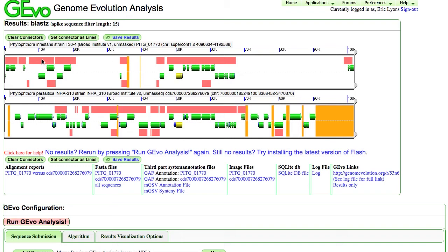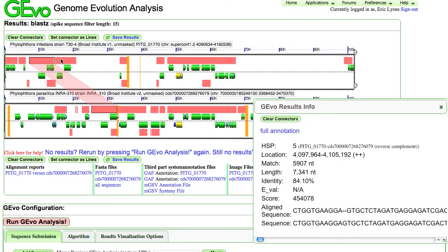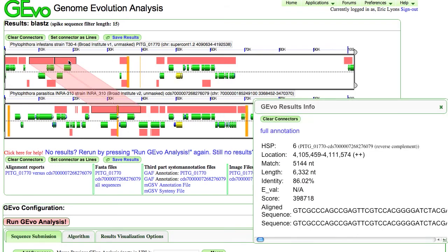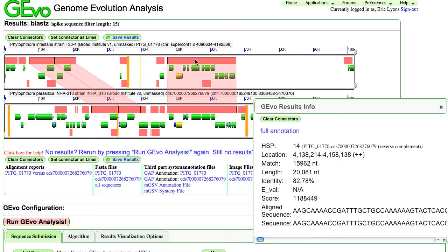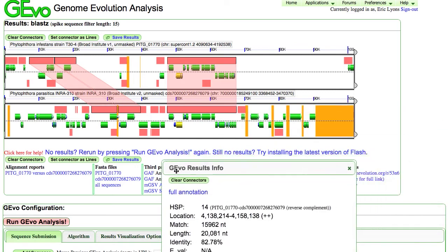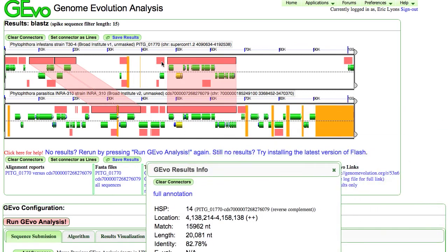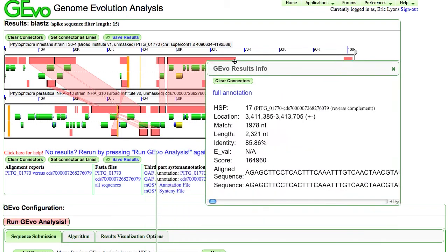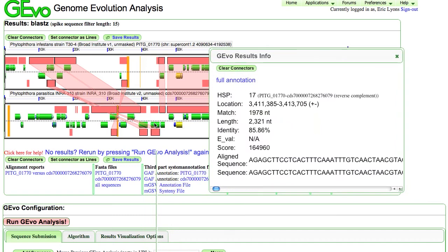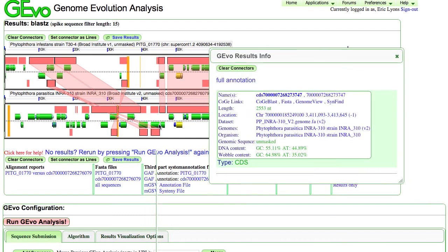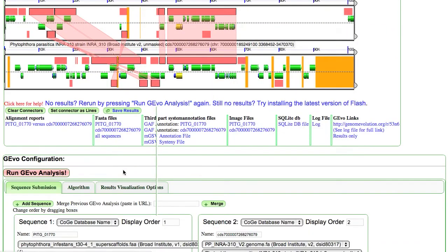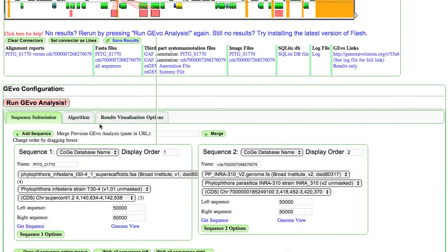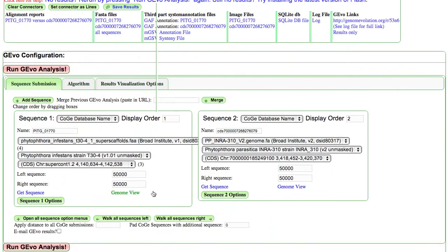And these orange blocks represent regions of sequence similarity. If I click on them, it will connect those regions that are similar to one another. Now, regions that are identified in the same orientation are drawn on the top and those in the opposite orientation are drawn on the bottom. And so this is interactive. You can click on any of these genes. You can get more information about them. You can blast them. You can search them.